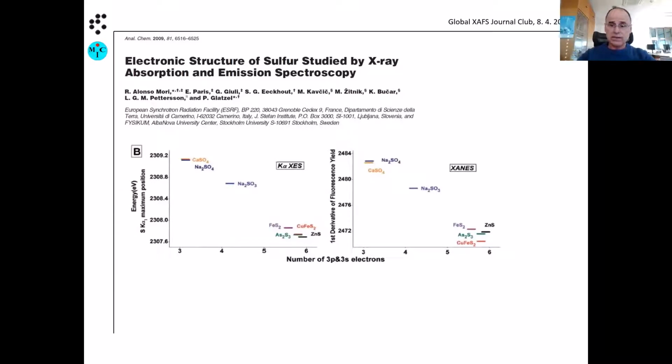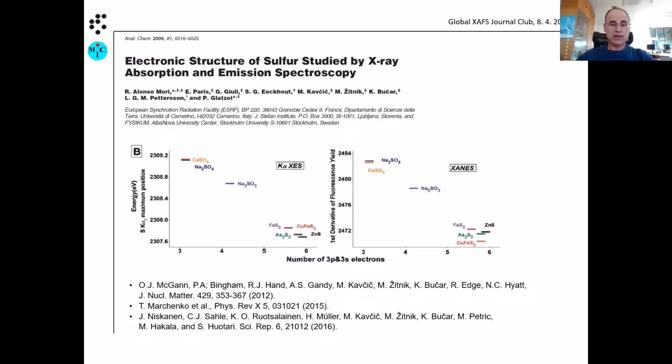Okay, based on that, in next experiments, we have measured sulfur many times over and over. I have selected here 3 examples because I find them representative. The first one is on a solid material, so sulfur within a glass material. The second one is a molecular study, so CS2, a gas phase target.